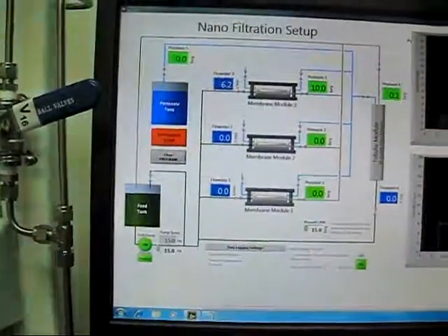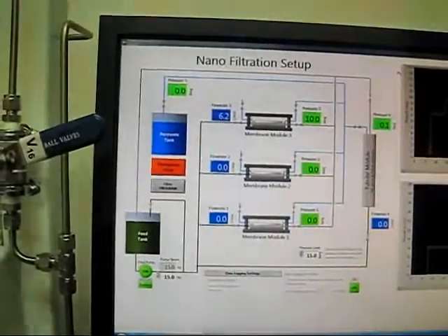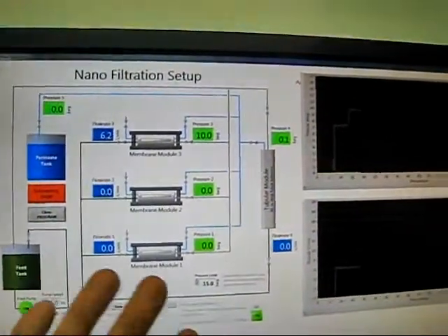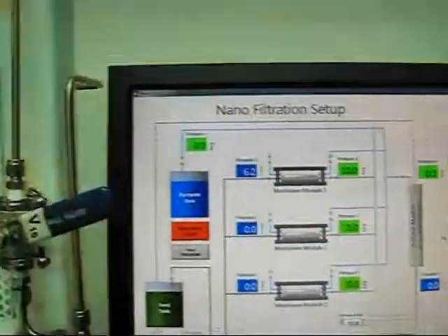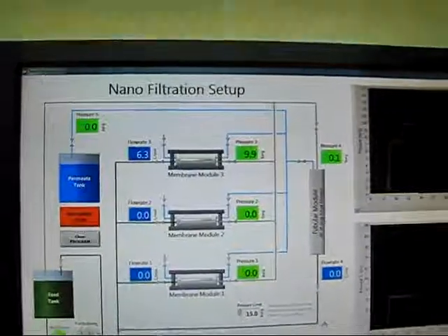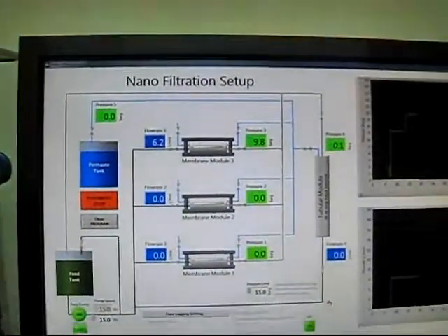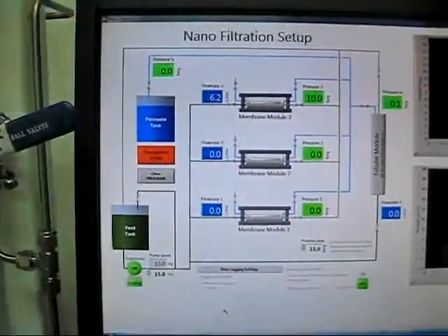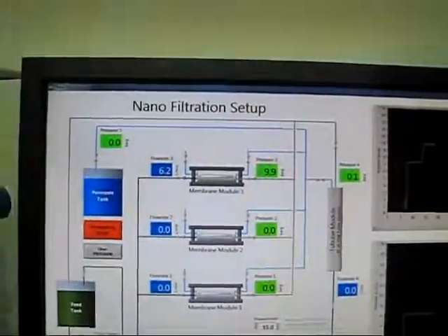But that's not advisable. We should always start by changing the flow rate by shutting off the feed pump first. Then stop the experiment, fully open the valve to release the pressure, and then increase it to maybe 18, 19, or 20 Hz as we move along. This is the safer way. If we increase it directly, as we will demonstrate in a negative demo right now, you will see that it exerts a lot of pressure on the membrane and the value is likely to overshoot very quickly.